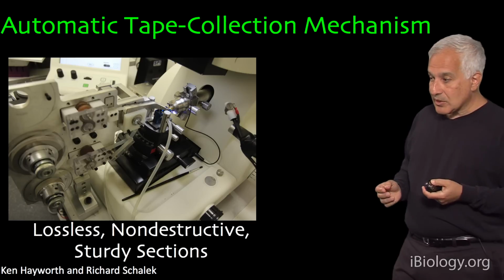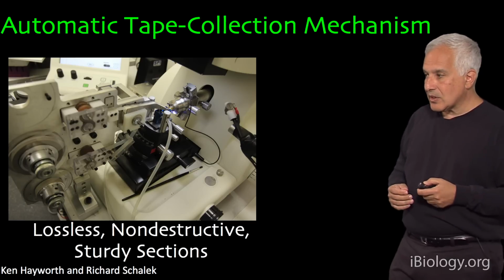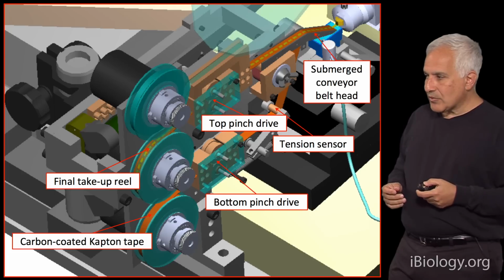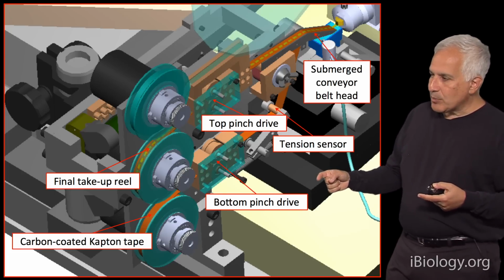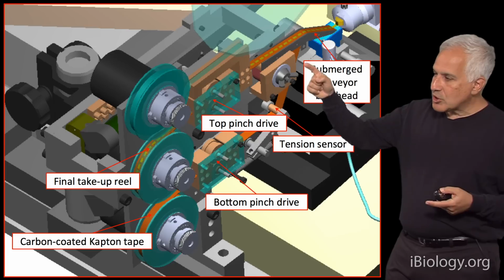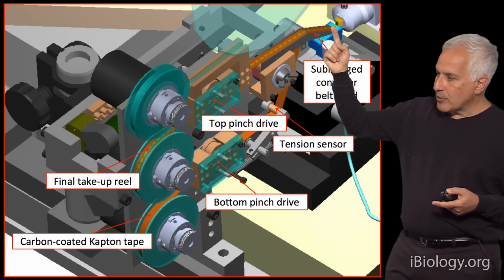We don't destroy sections. They're sturdy, and once it's made, these sections last a long time. A diagram of this device is shown here. It kind of looks like a movie projector, but it's really a movie projector in reverse, in the sense we're generating a film. These are the individual sections that are coming off of a piece of brain.